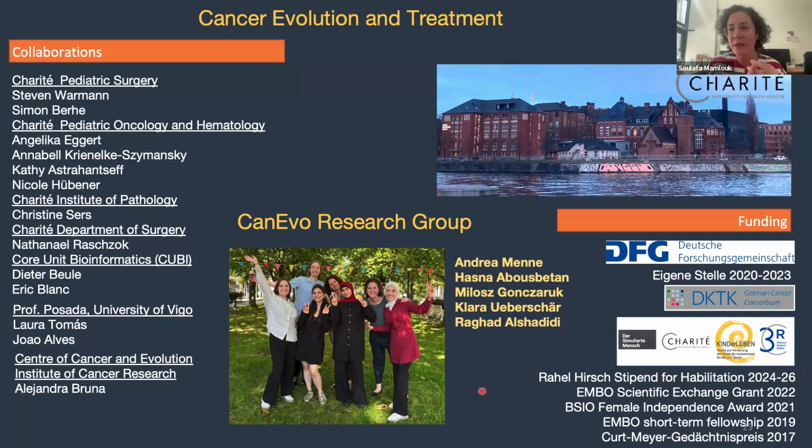In colorectal cancer, it's been really well documented that the response you get from certain treatments with organoids is representative and can be used to compare to a patient. But of course, we are trying to do co-cultures with other cells from the microenvironment. And eventually we want those cells to be from that same patient. So we have fibroblasts and the tumor, the neuroblastoma, from one patient that we try to grow together.